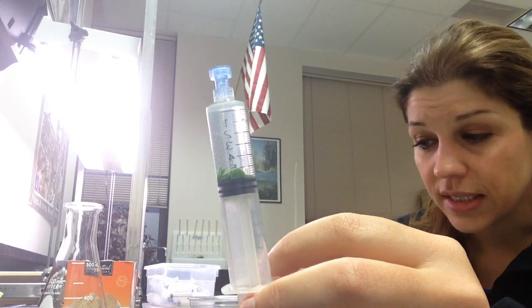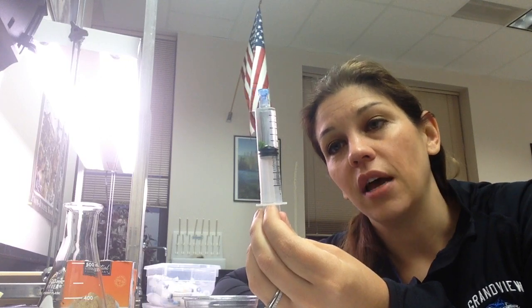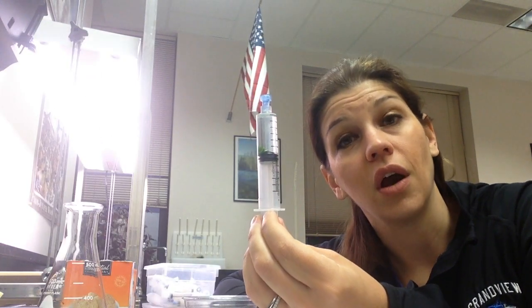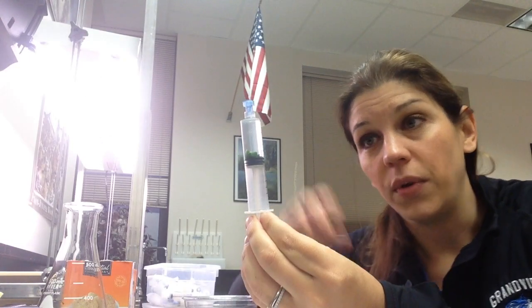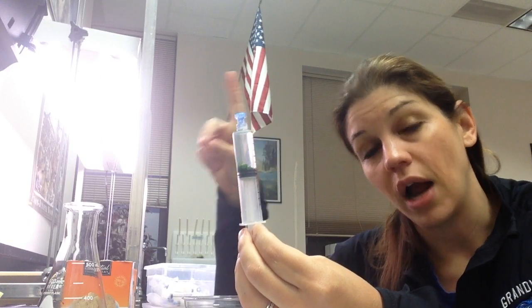The reason we're doing 10 discs per test instead of one disc like with the enzymes is because the vacuuming process is actually damaging the cells — it's not normal for a spinach leaf to undergo this kind of pressure. So we know some discs are being damaged. We put 10 discs in and dump them all back in the cup; all 10 discs together are one trial.